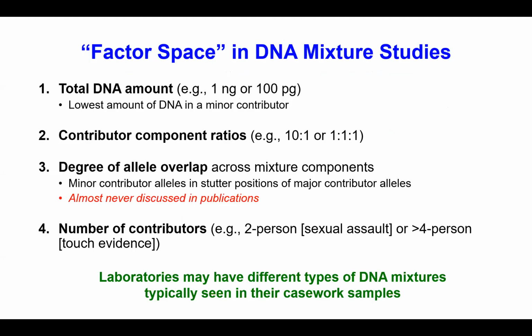How much has that been tested for in terms of validation experiments? You have the contributor component ratios. If it's a two-person mixture, it might be 10 to 1 or 1 to 1 or so on. If it's a three-person mixture, it may be 1 to 1 to 1, or 1 to 1 to 5, or some other relative ratio of the contributors that are present.